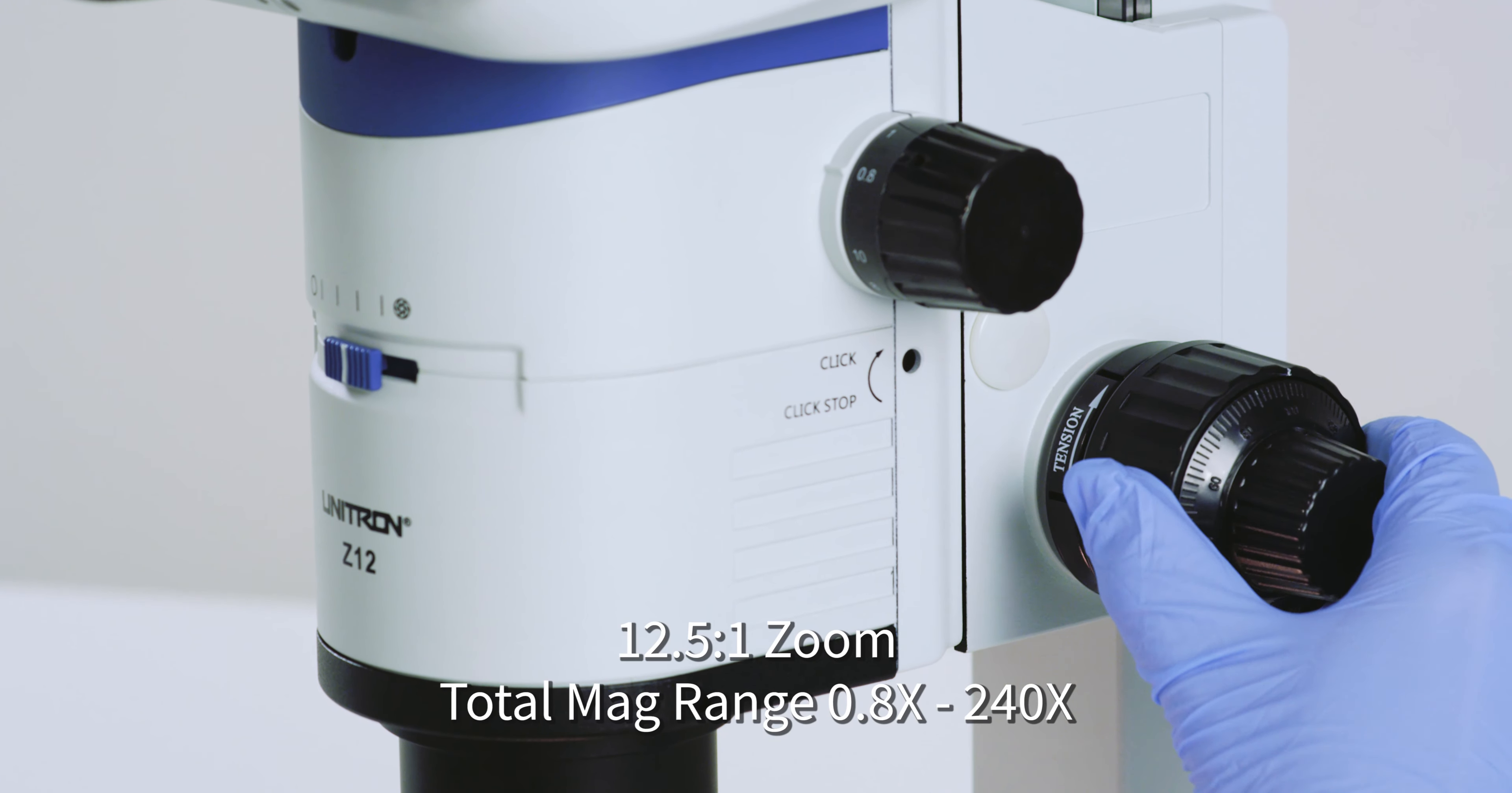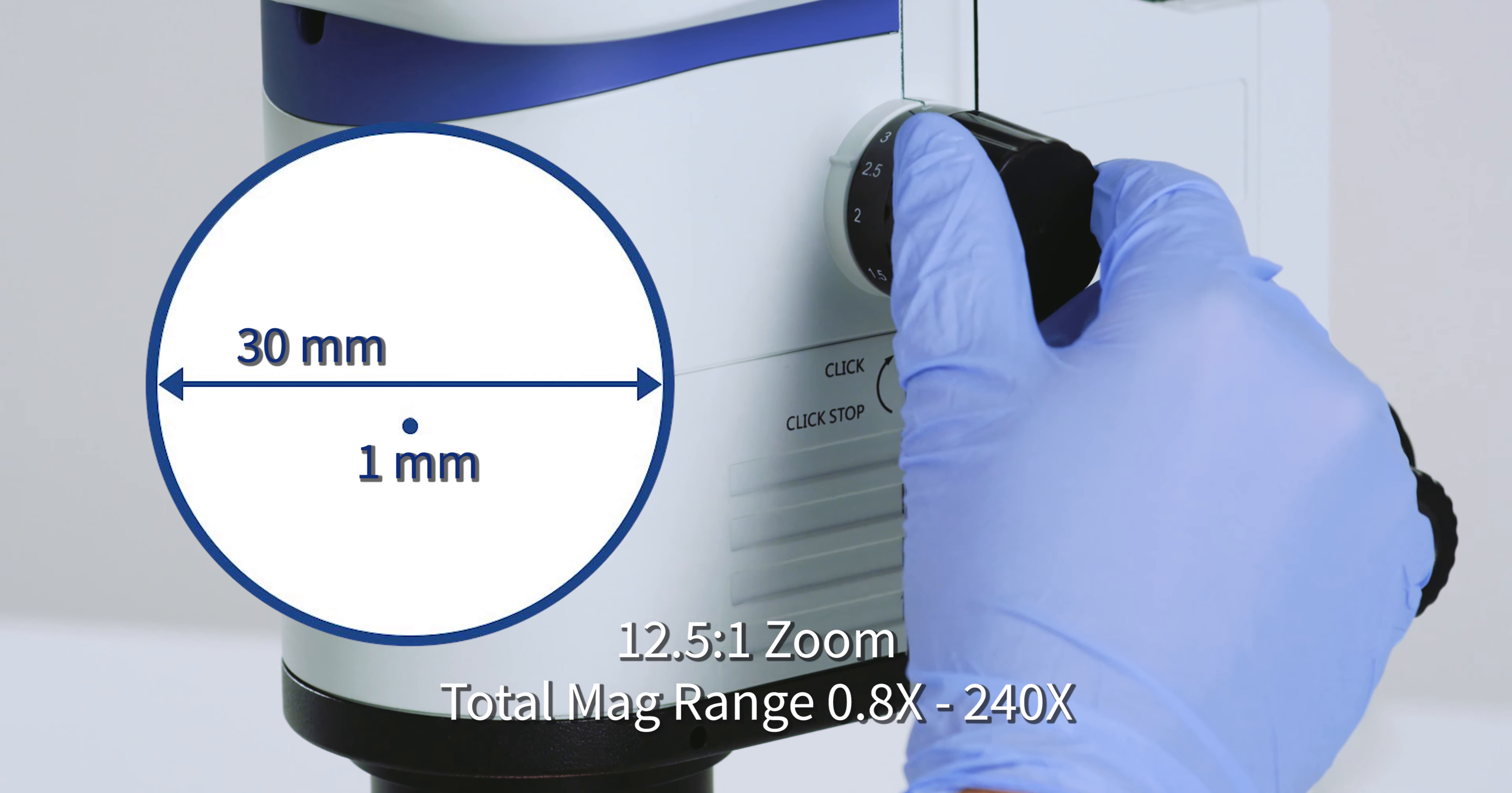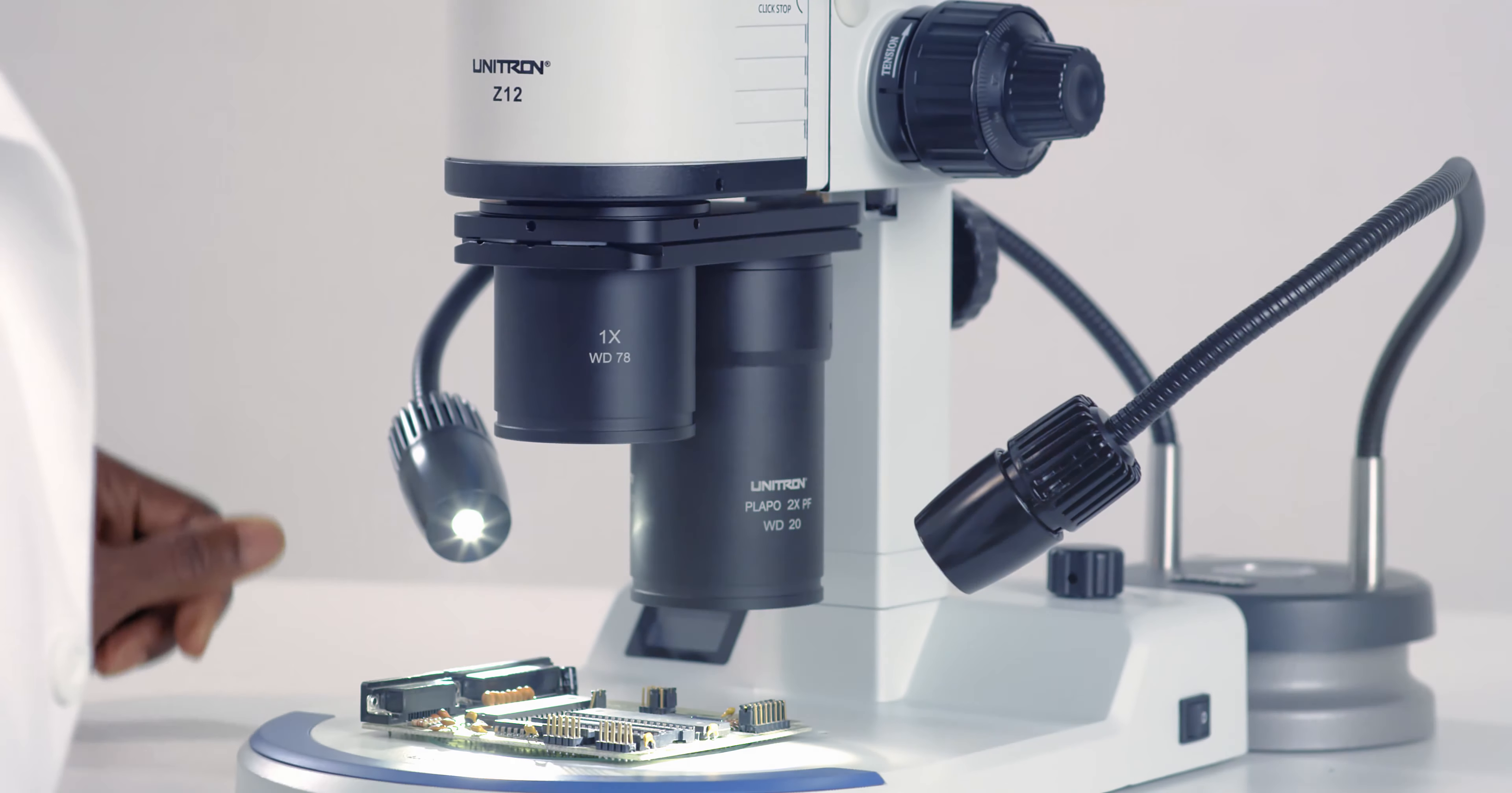The 12.5 to 1 zoom ratio and a magnification range of 0.8x to 240x provides a field of view from 30mm wide down to nearly 1mm. Click stop positions on the zoom knob ensure reproducible magnification changes. Use the optional nosepiece changer to easily change objectives and magnification ranges.